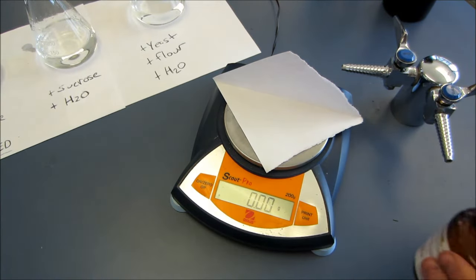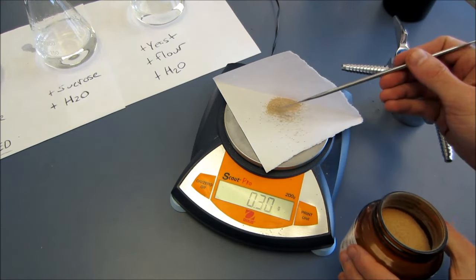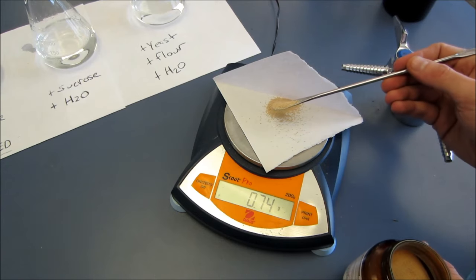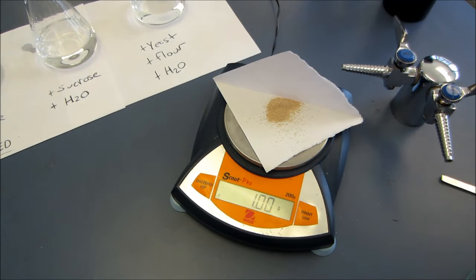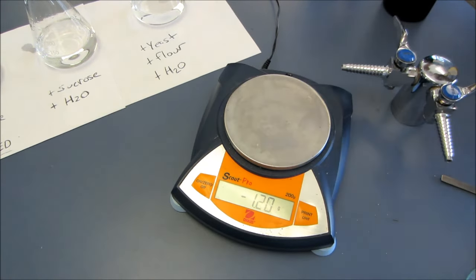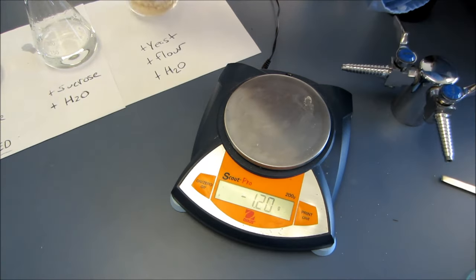Some of the flasks, four out of five of them are going to get yeast. Yeast is a unicellular fungus, kind of like a mushroom but just one cell. It's a heterotroph. It needs to eat other things. In this case I'm going to feed it sugars. It performs anaerobic cellular respiration, otherwise known as fermentation, instead of aerobic cellular respiration.